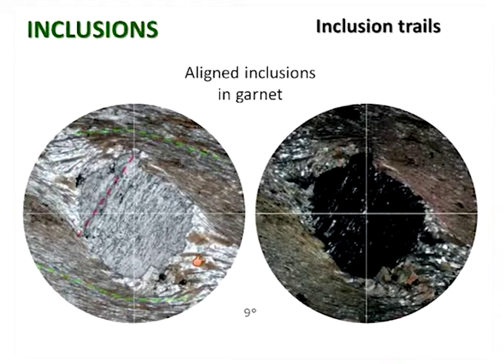But the garnet has inclusions which run almost 90 degrees to the external fabric, and I picked that out with a red dashed line here. So this fabric, the internal fabric, is clearly different from the external fabric. The garnet must have grown over this fabric when the fabric was running northeast-southwest, and since then the rock has deformed. Let's imagine that the garnet stayed still during this whole process.